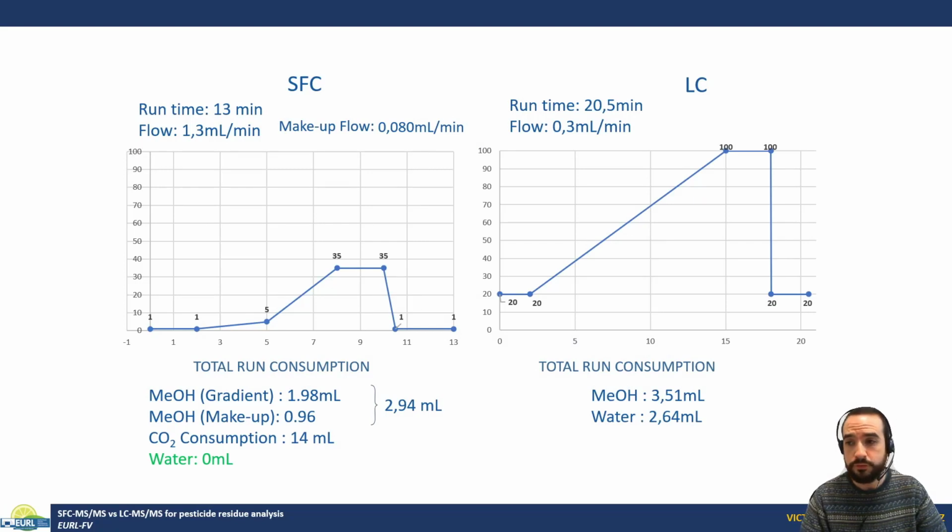Regarding solvent consumption, here we can observe that the methanol consumption is usually lower compared to LC, and there's no water consumption. Instead, we are using carbon dioxide, which is usually cheaper and can be easily recycled. Therefore, it's within the green chemistry movement.